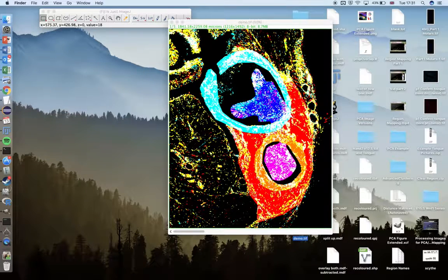This video looks at the Advanced Color Distance Analysis plugin. To start with, let's look at an image that is set up for use with this plugin. For this, we're only going to be examining one single image and not multiple images that will follow in a subsequent video.